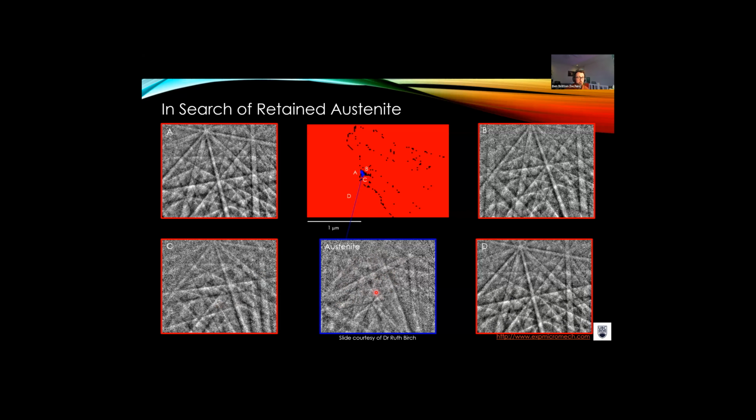But what's particularly cool in here is we can also see directly that these different ferritic laths and the associated austenite grains have some overlap. So we can see common bands and poles, which are associated with all of the orientation relationships. And this tells us again about the crystallographic processing, the thermomechanical processing of this steel, and hopefully the properties of that steel.